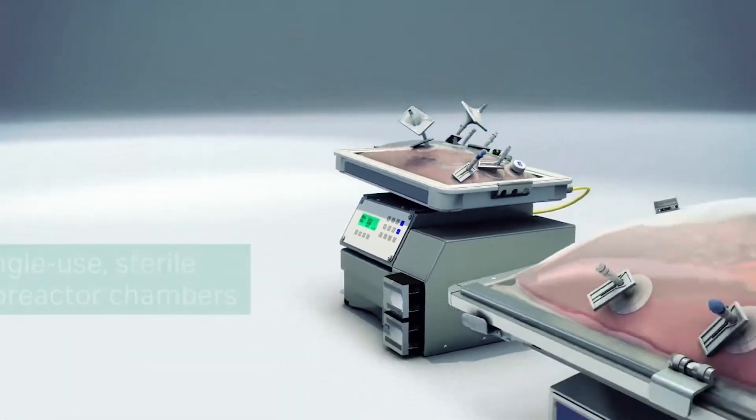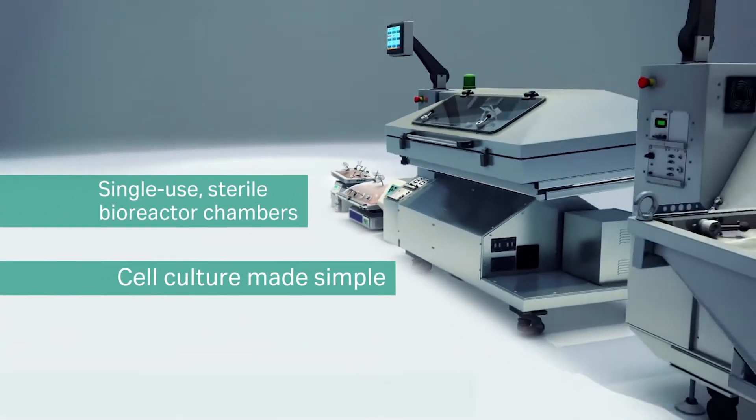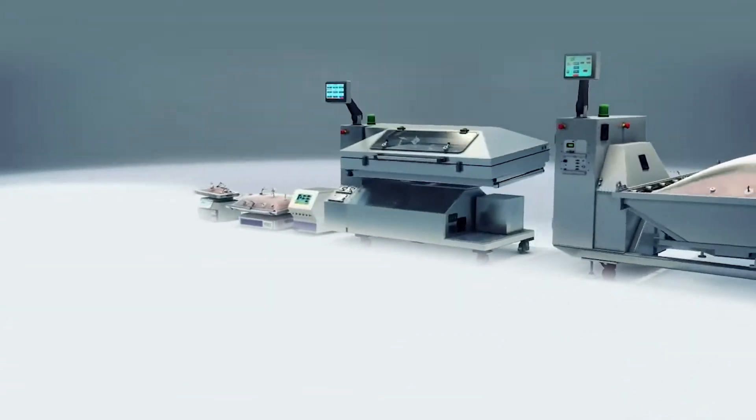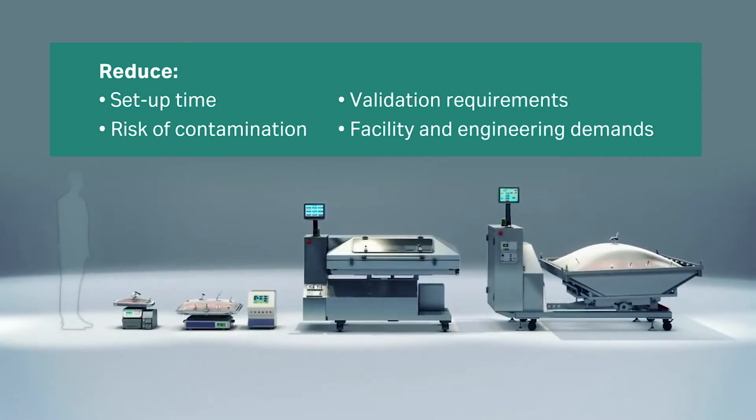The Wave Bioreactors utilize single-use, sterile bioreactor chambers. It's cell culture made simple — cell culture using waves. What was once a trend is now a standard. Cytiva continues to lead the way in simple, effective cell culture.